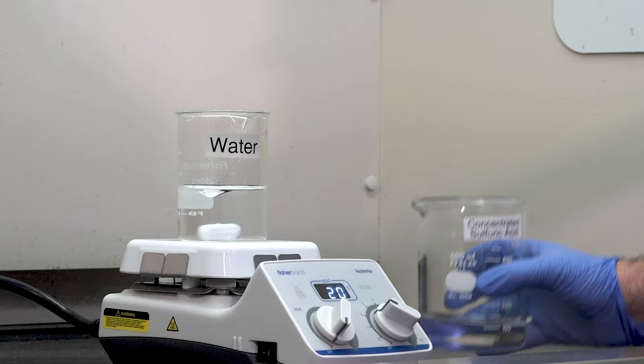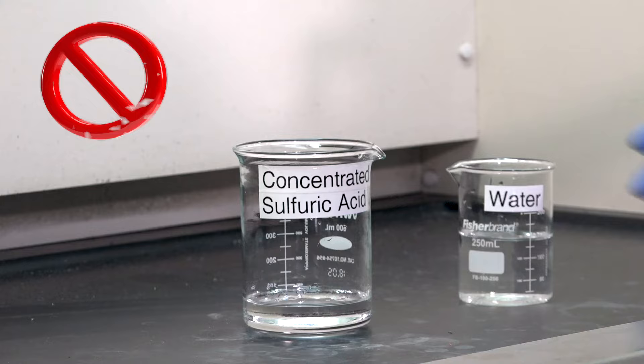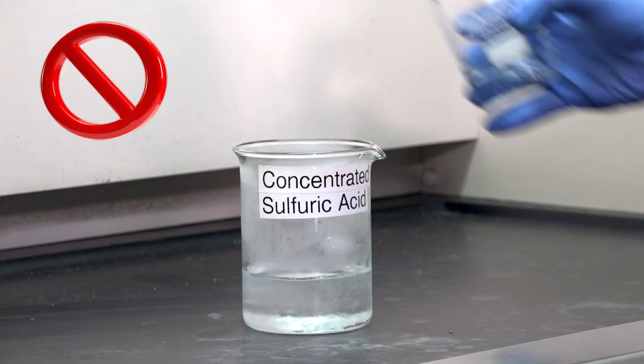Another special consideration when handling acids and bases is when performing a dilution or mixing an acid or base with water. It's important to remember the phrase: add acid to water, not water to acid. When water is added to acid, the heat generated can be so large that it causes the water to boil instantaneously, leading to uncontrollable splattering of the acidic mixture.